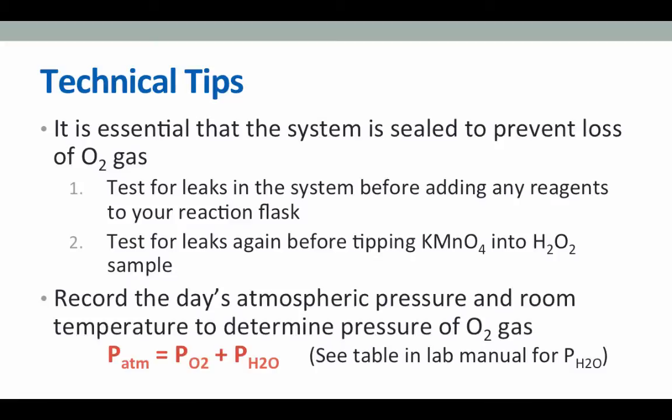Your lab instructor will let you know the day's atmospheric pressure and room temperature, but make sure you also record these for later reference in order to do your calculations. Please do not forget to factor in the pressure of water when you're calculating the pressure of oxygen gas.